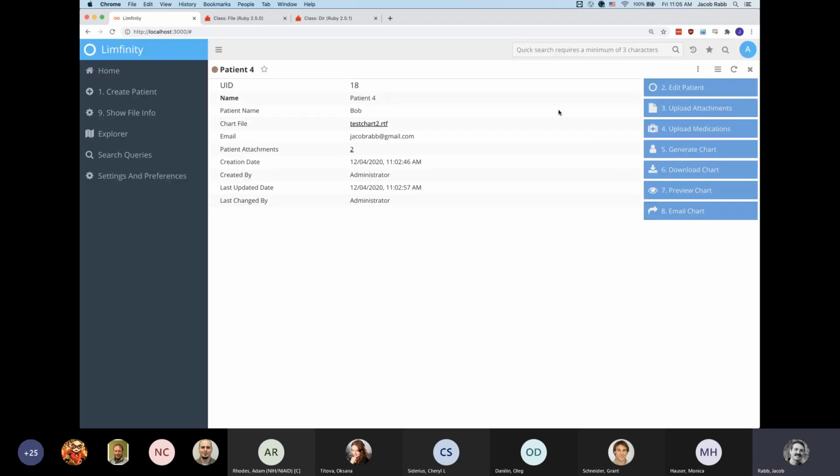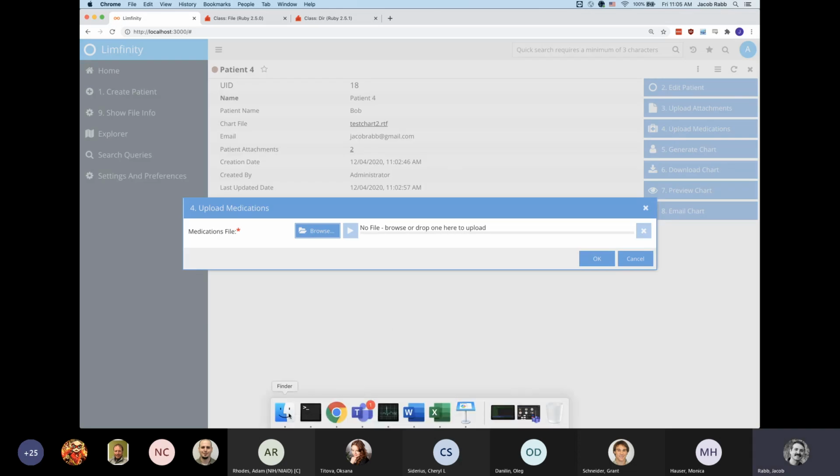All right, great. So I'm going to move on to the next example, which is processing a file. This time we're going to take a file and turn it into multiple subjects in memory, and we're not actually going to save the file to the database. We're just going to save the subjects that it creates to the database. So first of all, I'll demonstrate it.